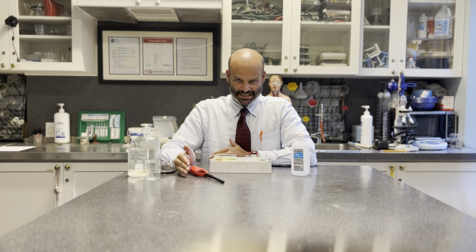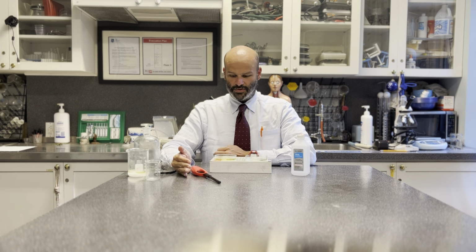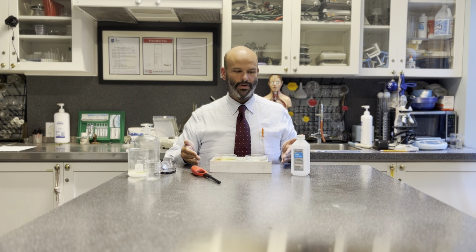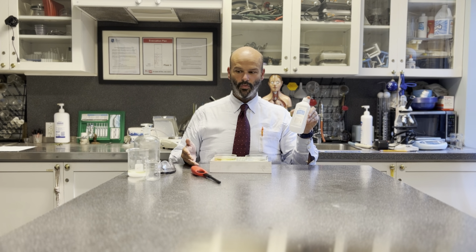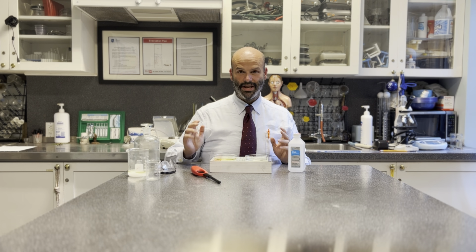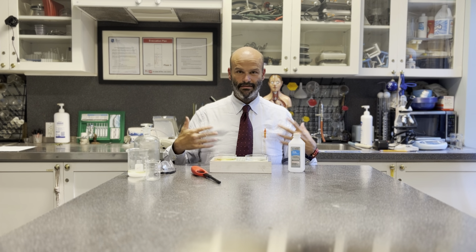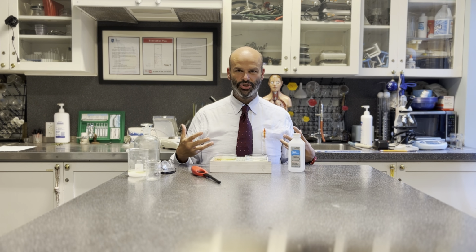My goal is to basically get the lab experience that my kids have down into a couple of minutes so that you can get the most important part of the science, which is the actual exploration of the beauty of the world. All right, so we have here alcohol. Woohoo! Not the kind that you drink. 70% alcohol, 30% water, and we purified it to 95% alcohol. We're doing that not for a party, but for exploring the idea of combustion, meaning fire.